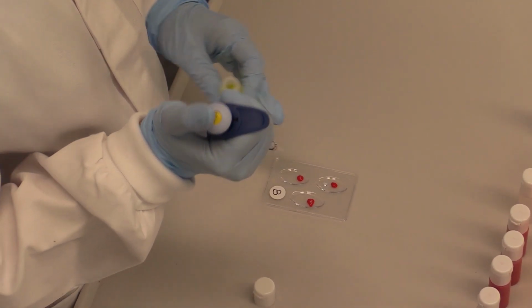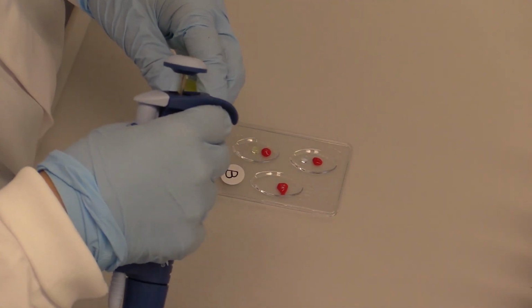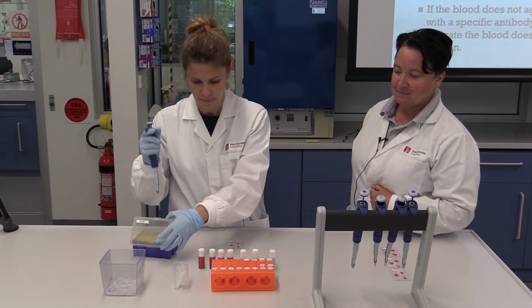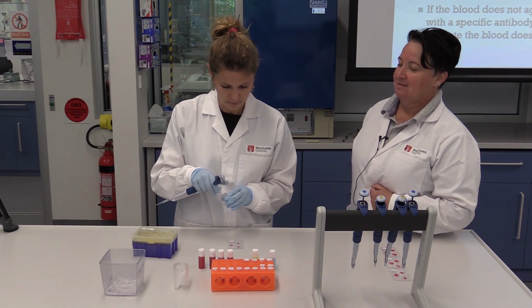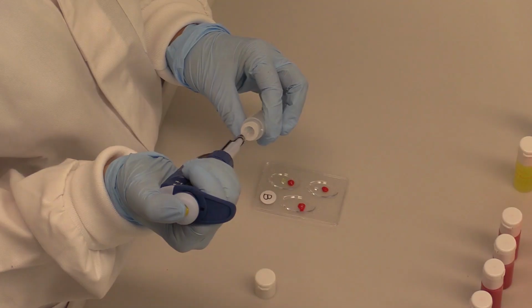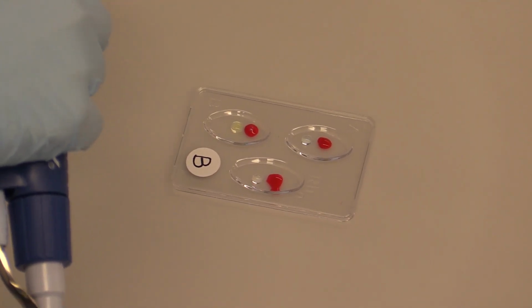aspirate from the first stop, and expel by pressing to the second stop. And then finally, one more, taking the tip, closing the box, depressing stop 1, aspirating, expelling at stop 2, the second stop, discarding the tip.